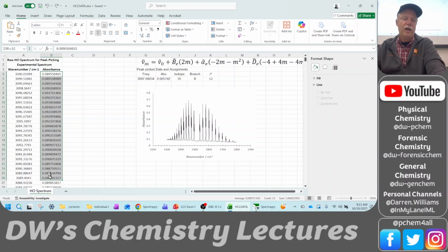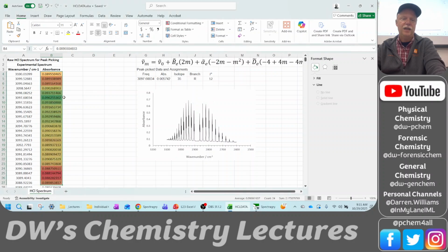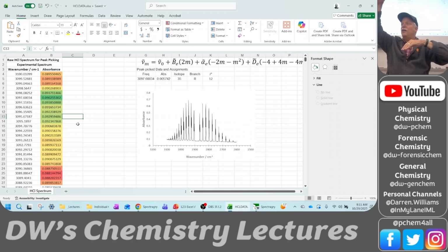We just grab the lines that we can see and do conditional formatting, because now we detect this line and this line, whereas before we couldn't see those. If you select the whole range, the top one is green, and the little weak peaks are not green because you've used green for the really, really tall peaks. So you want to do it in windows.